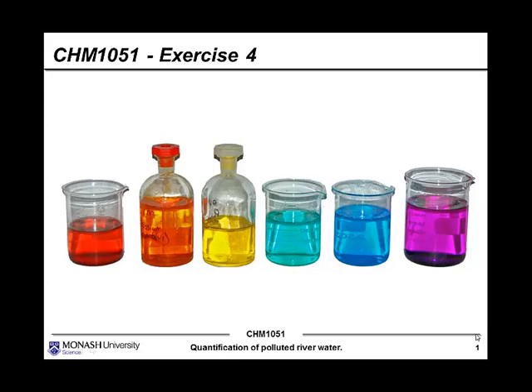G'day folks, in this pre-lab video we're going to have a look at some of the background behind your experiment, which is focusing on quantification of pollutants in some water samples that we've actually taken from an authentic site in Queensland. In fact, these samples have been sent down to us so that we could do some testing.